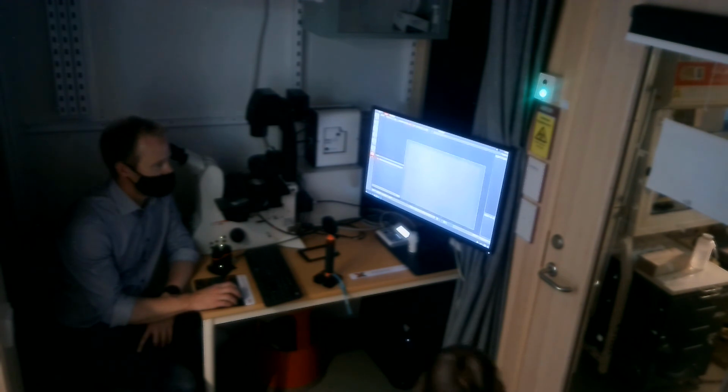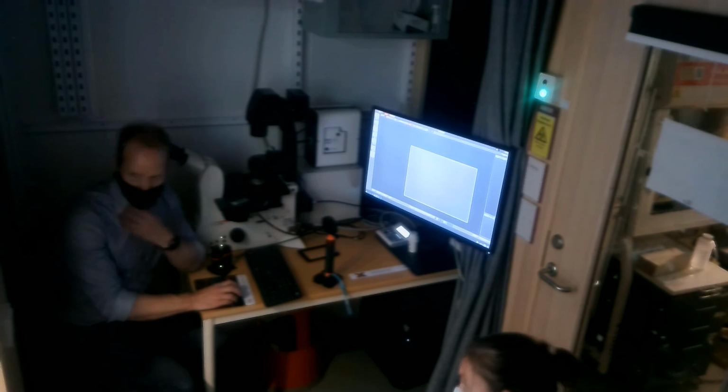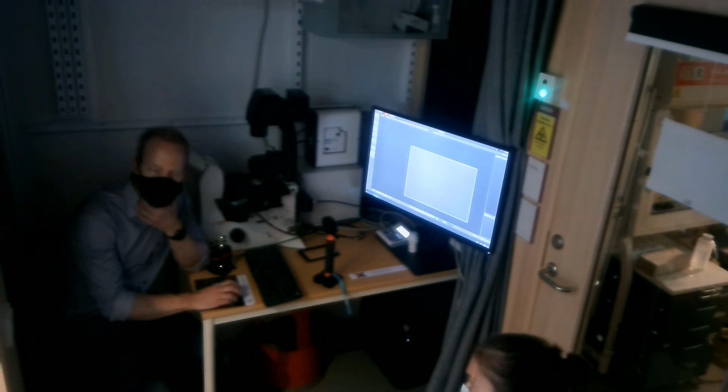Oh, just a question about the system. When it combines the different levels, it's called optical combining of sections? So can you apply that if you have, I don't know, pictures of about 5 focus sheets in this Z stack, and can you combine them to discard the out of focus parts?